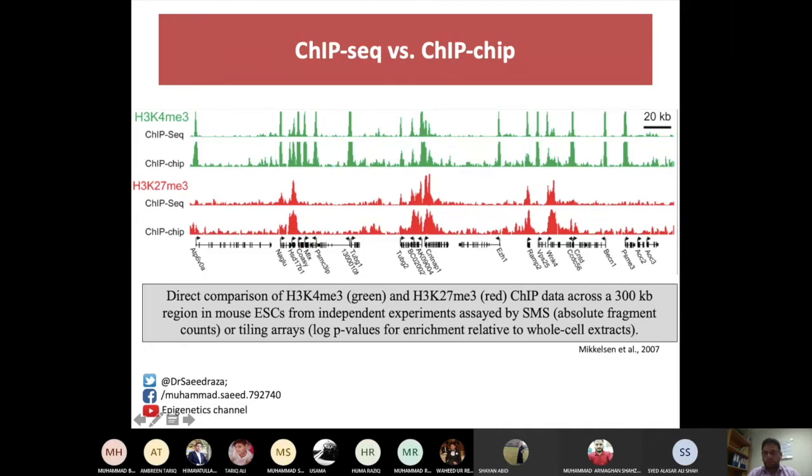So this is a native ChIP experiment where the natively generated antibody-antigen interaction was used to highlight this overall thing. So by the end of the ChIP analysis, the reads were made. The data was produced using two different techniques. One was the seq technique, and the other one was another ChIP.